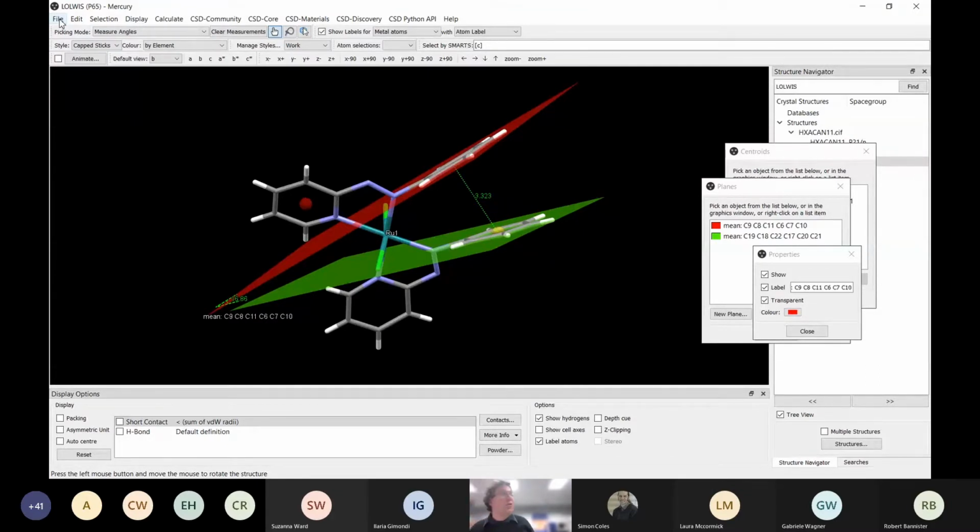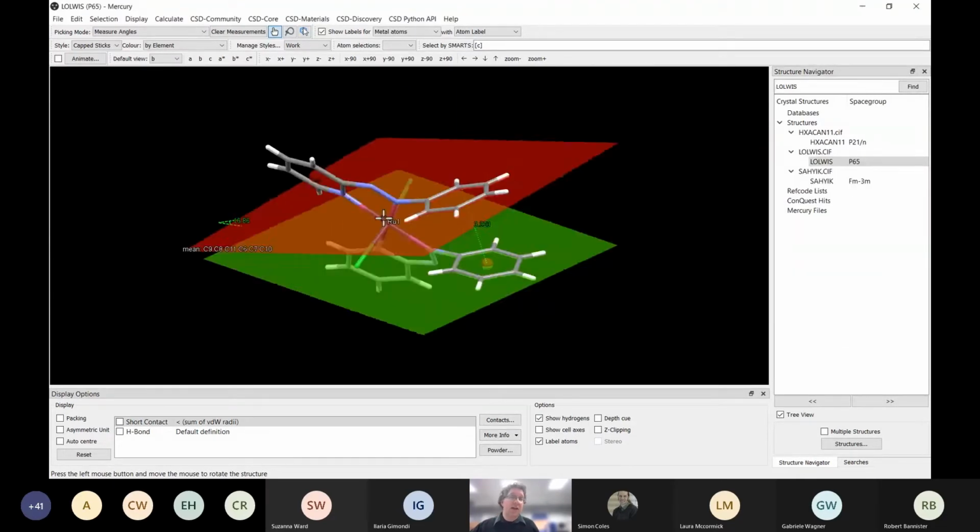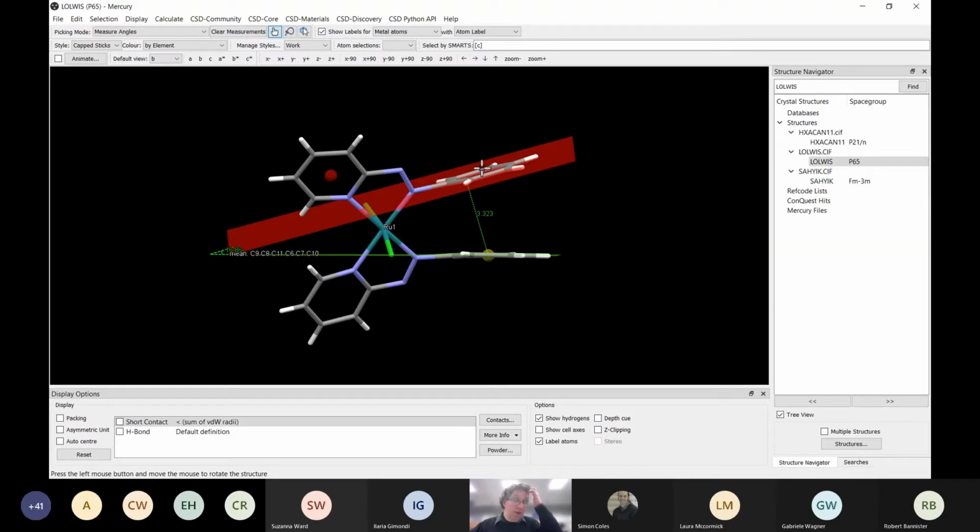So, I think that is about the end of my demonstration. I'm just closing these. So these are basic examples of what we want to do, but hopefully the last picture in the handout shows what is actually possible using Mercury to get very complex pictures.